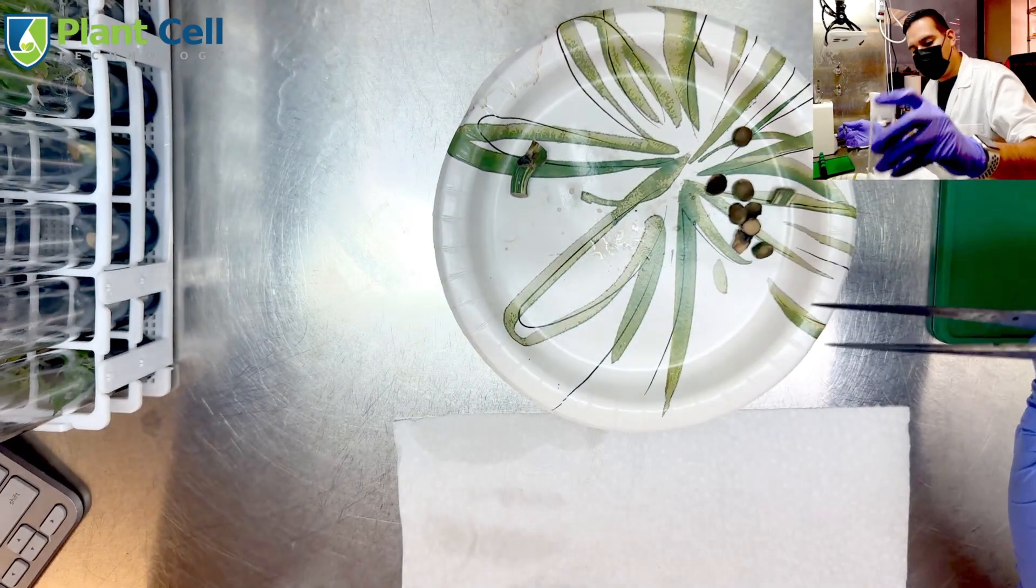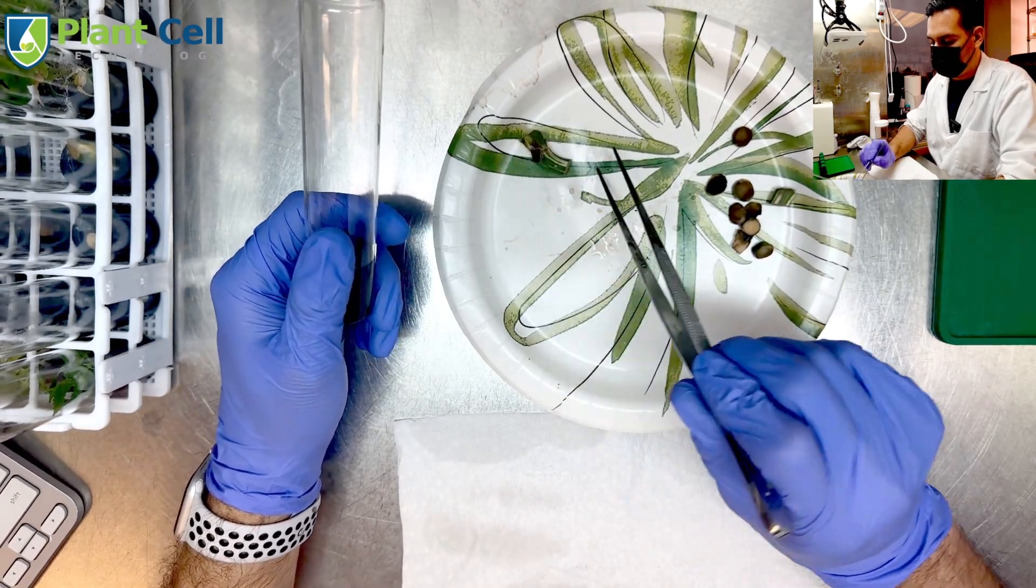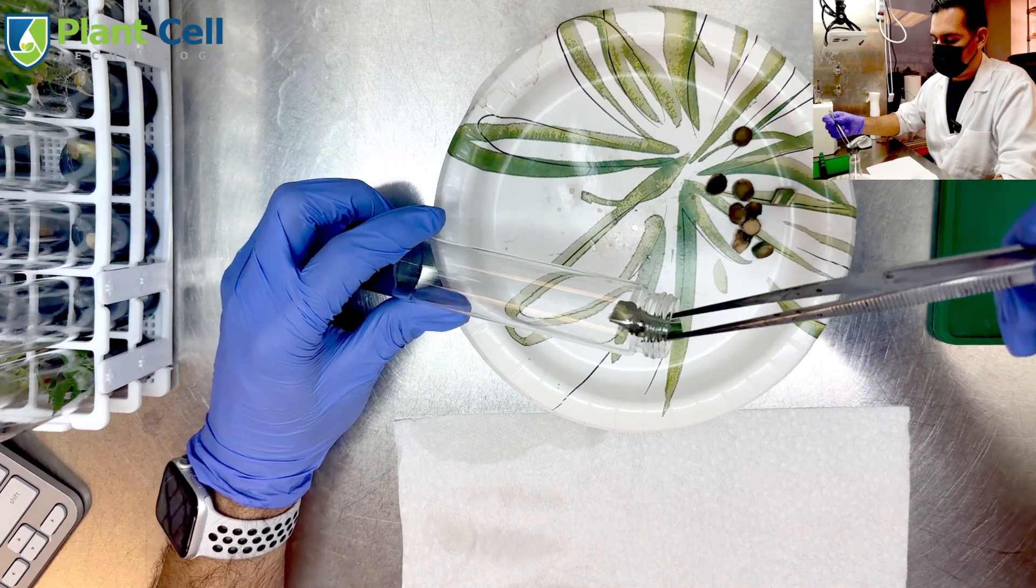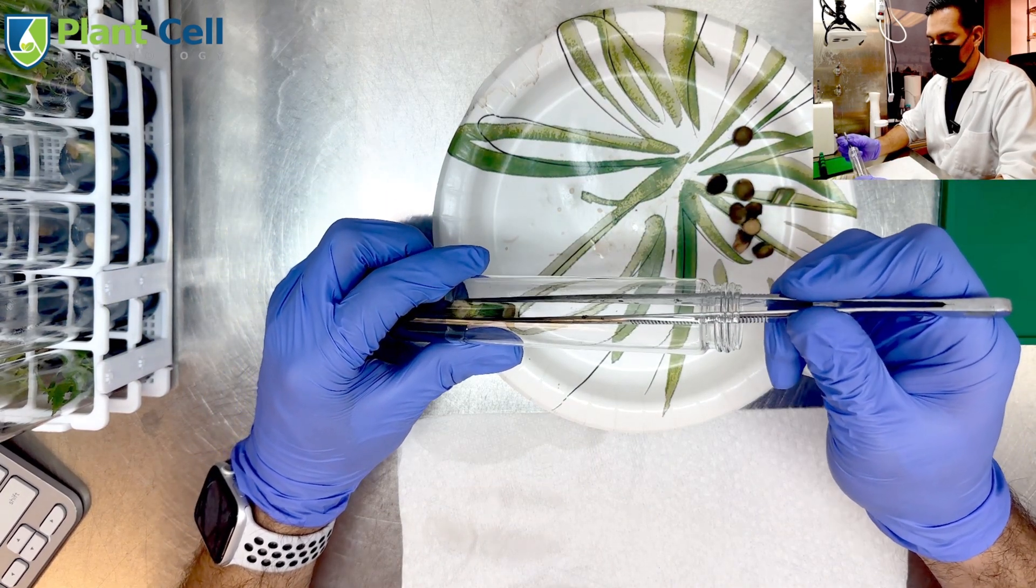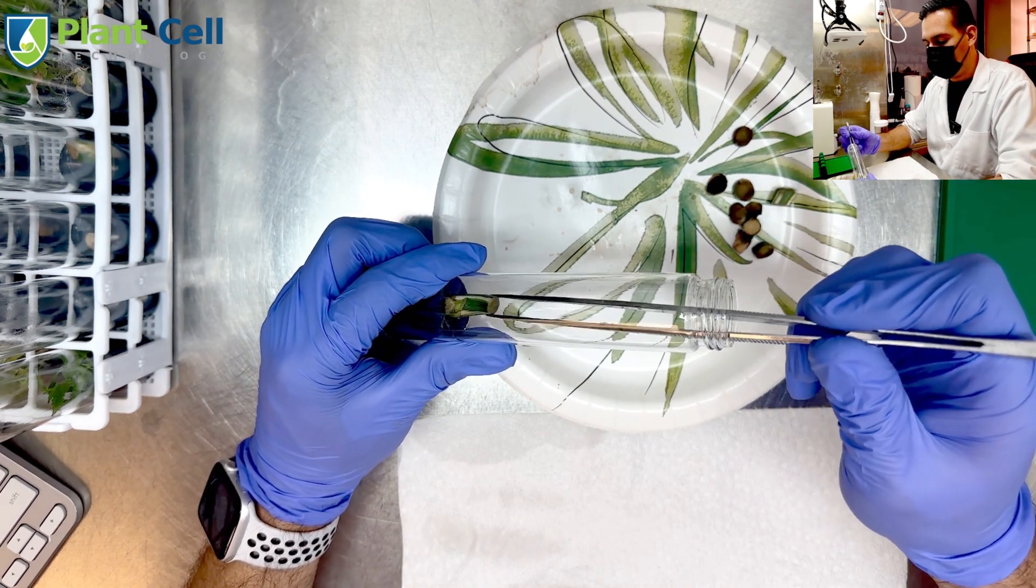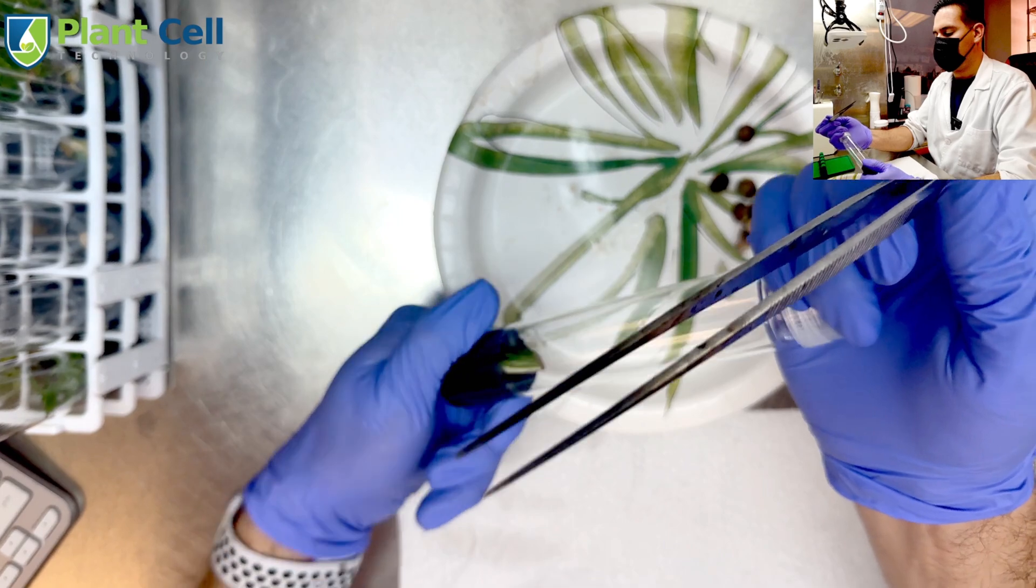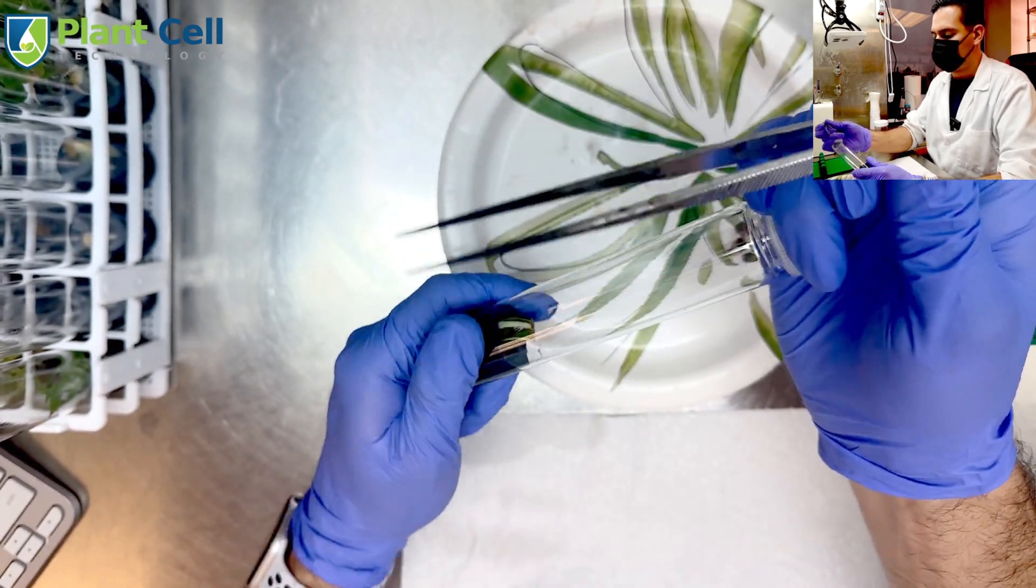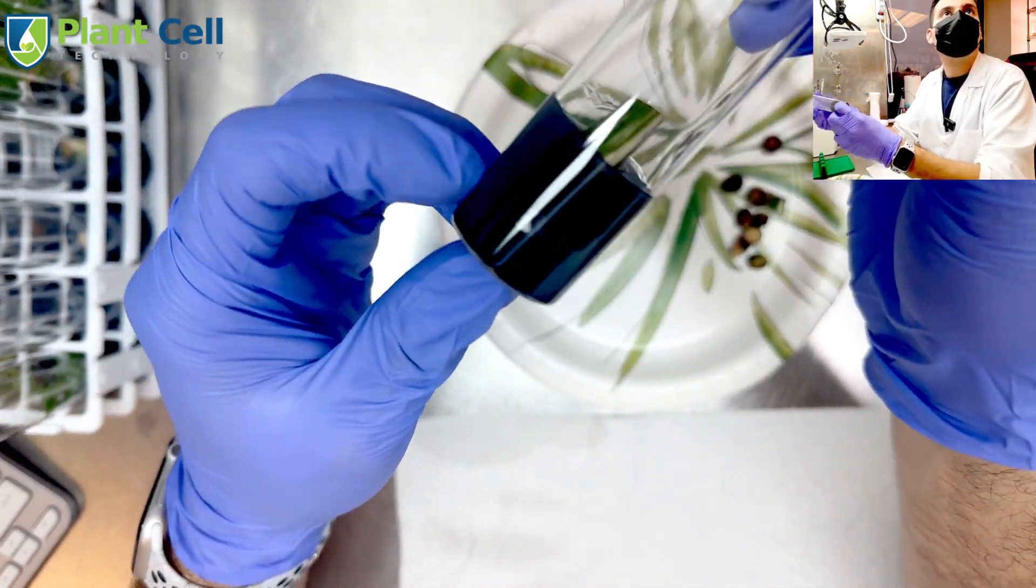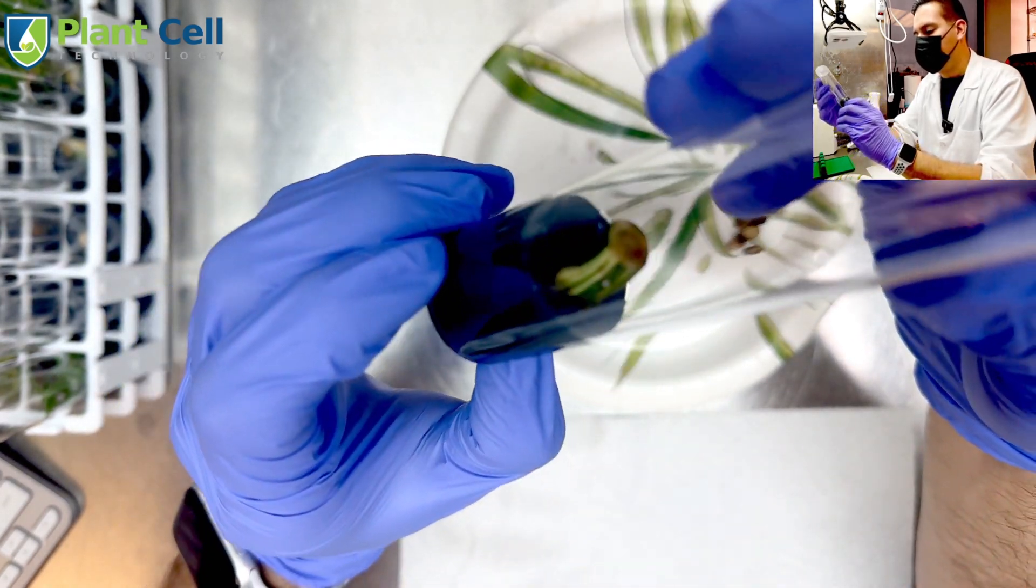There we go, I have the third one. I have one more. This media is fairly solid for these plants, but that's okay. There we go, that's how it looks. So that's the Monstera albo, and I hope in a few weeks we're going to start seeing some new growth.